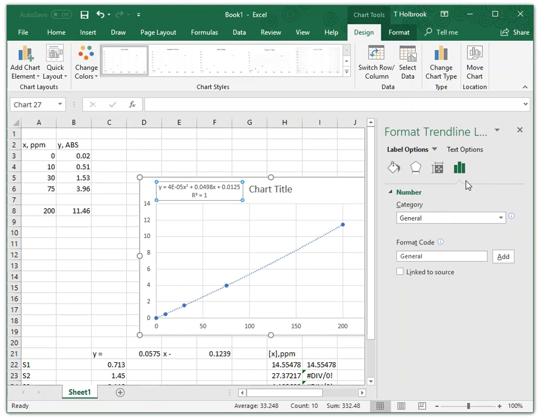And again, we do not like to go this route. We like for our calibration curves to be simple. We like for our calibration curves to be very bland, and we just want a linear relationship because those are the easiest things to solve for. When I start bringing in x squares and quadratic equations to figure out what x could or could not be, and then checking my answers, we're delving into areas that could cause us problems in a laboratory. And as a lab manager, they don't want to see that. They want your job to be simple, straightforward, and clean. They don't want all of these extra math components that aren't needed in a laboratory. So for those of you that are a little weak in math, you can take a deep breath, because that is what they're looking out for with you as an employee.